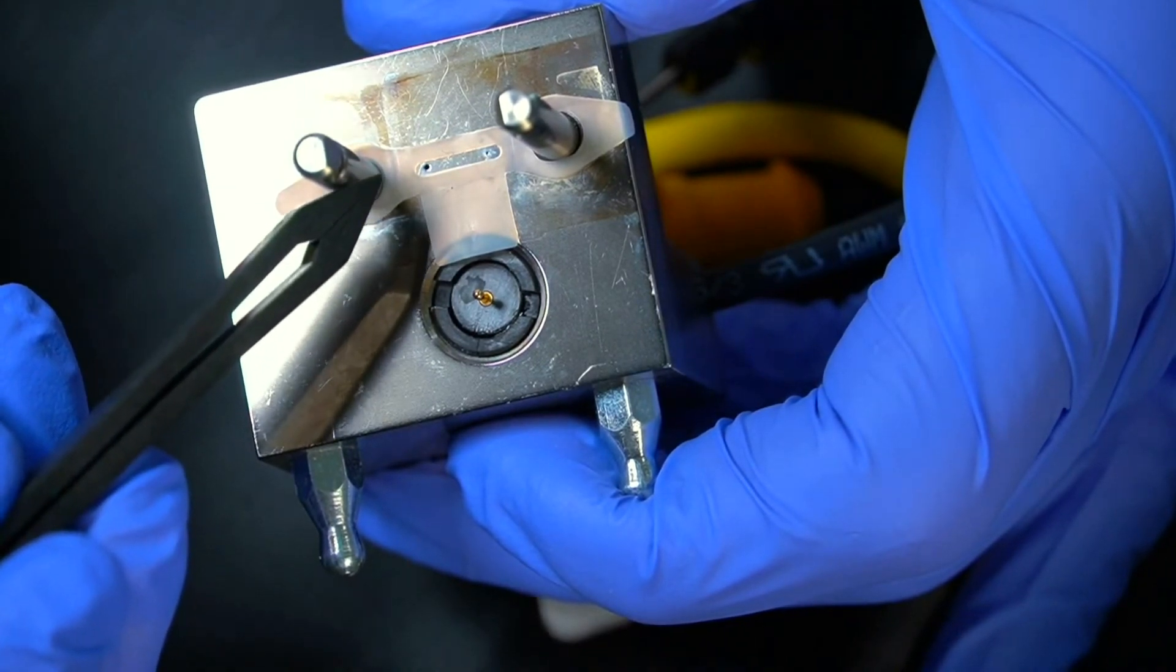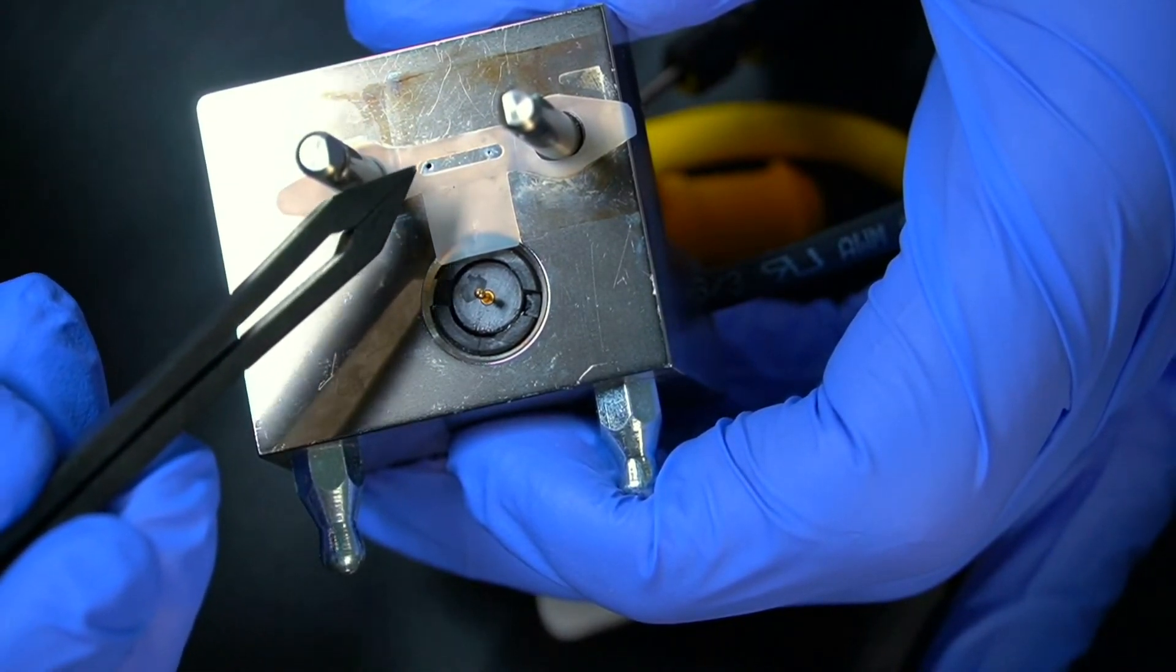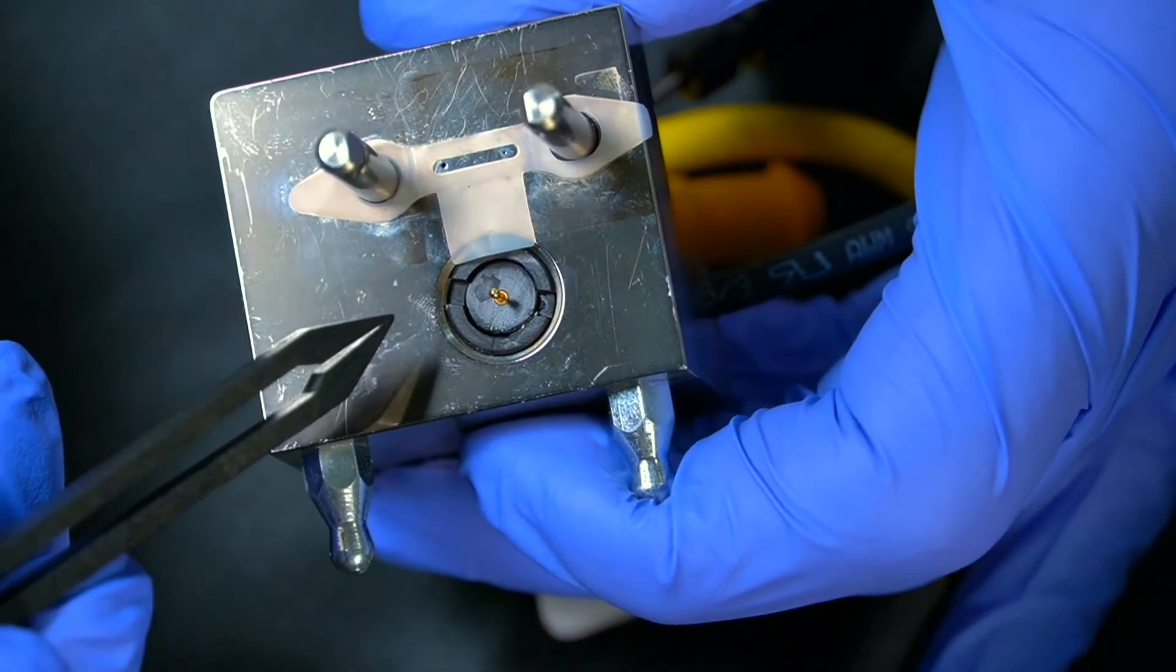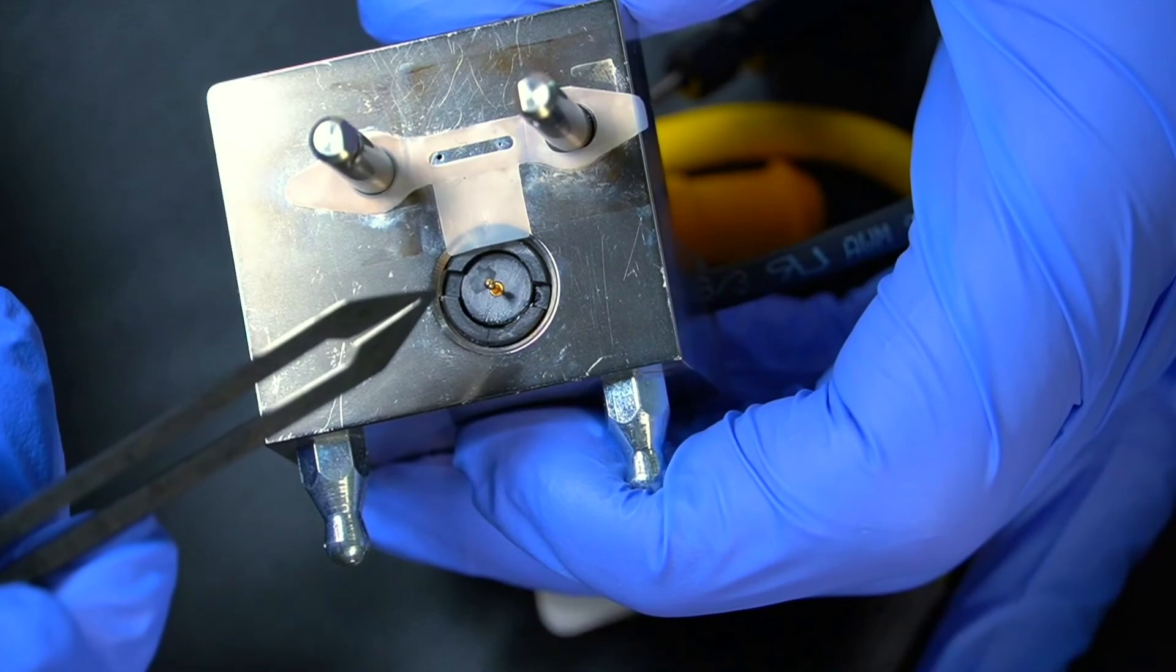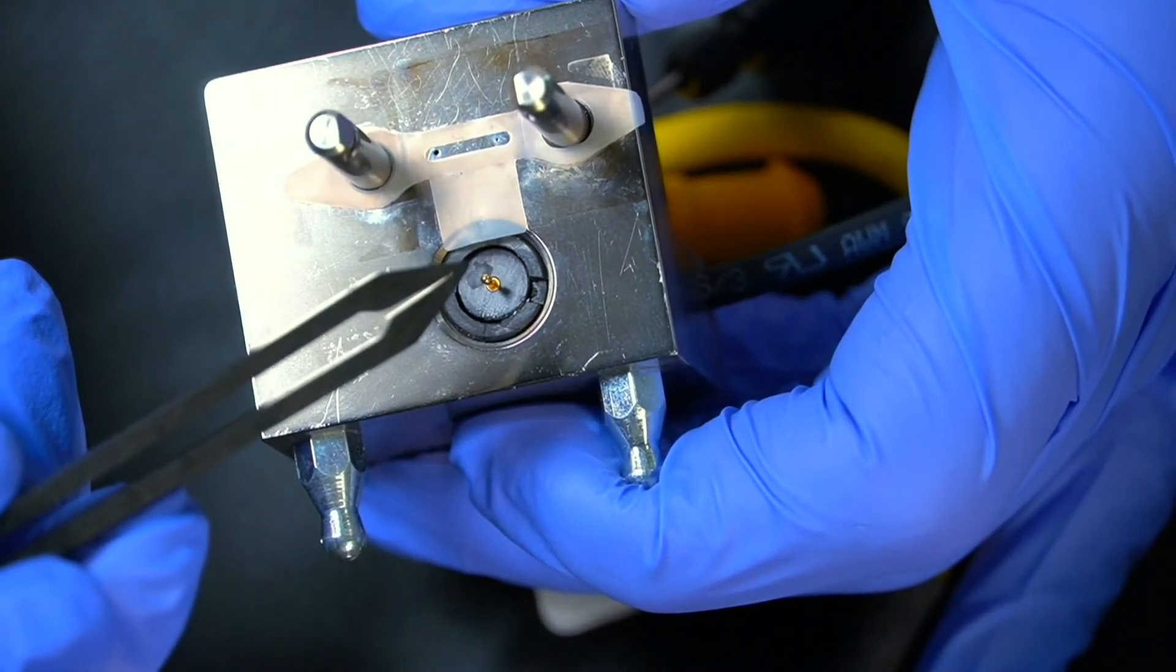The eluent flows in one side of the slot, flows through the slot and over the surface of the working electrode. That's where the reaction happens and where the currents form that give you your peaks, and it flows out of the other side.